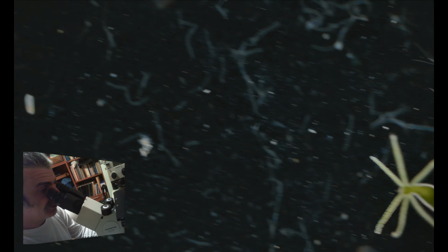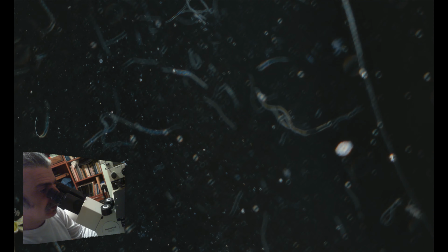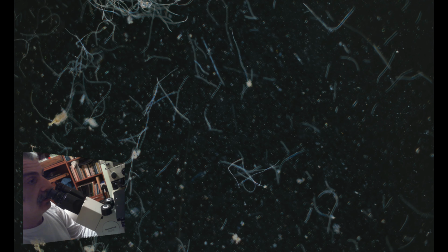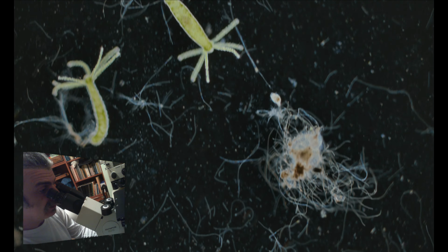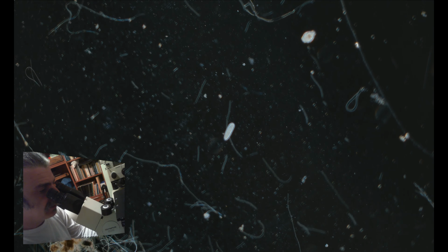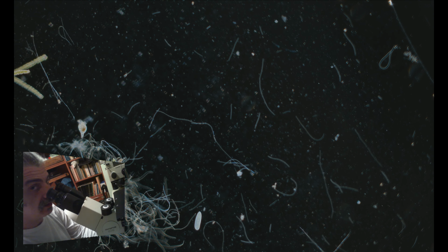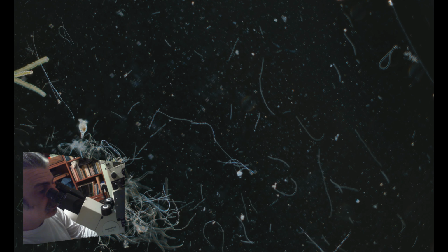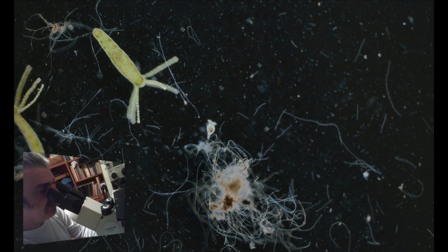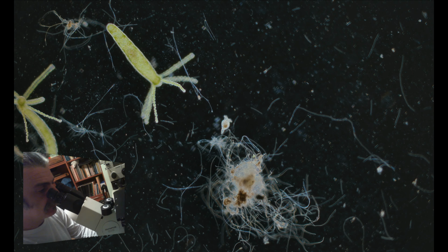We start with the 4x objective, so we can get a very broad view of our sample. We're scanning a sample of about 5 by 5 centimeters, and right now with 4x our field of view is 6 millimeters. So whatever screen you're watching, whether a smartphone, a computer screen or a large TV, the width of the frame now is equal to 6 millimeters.